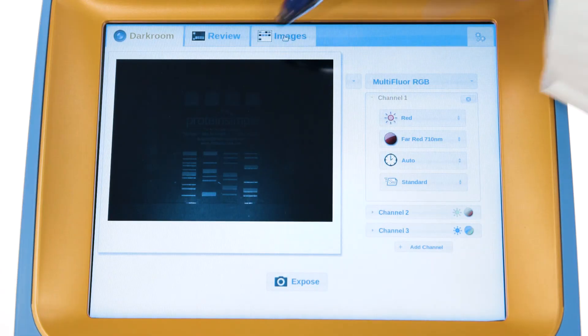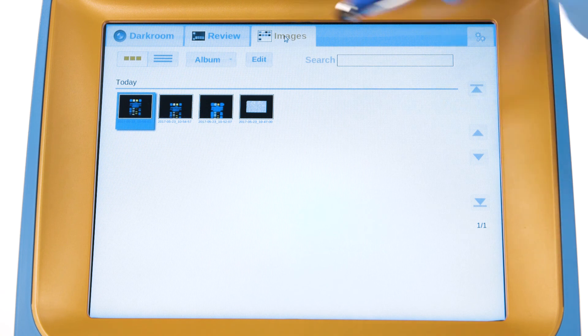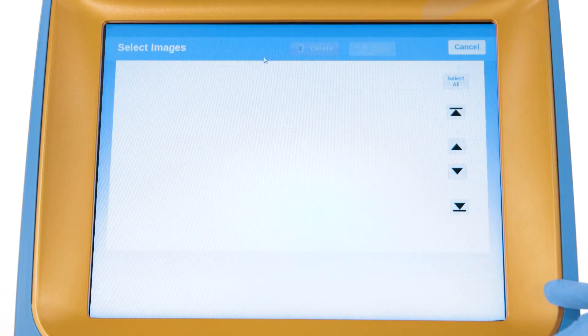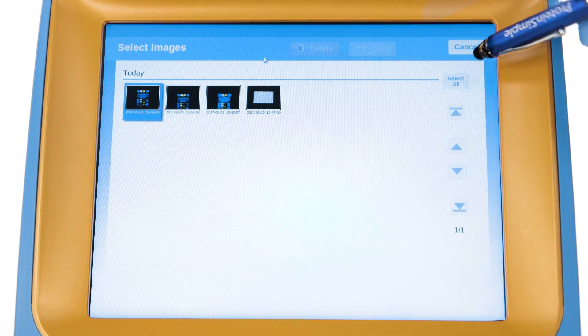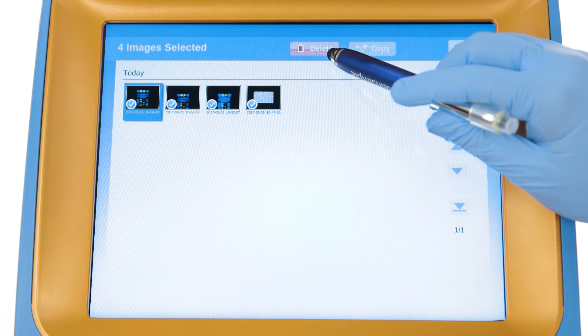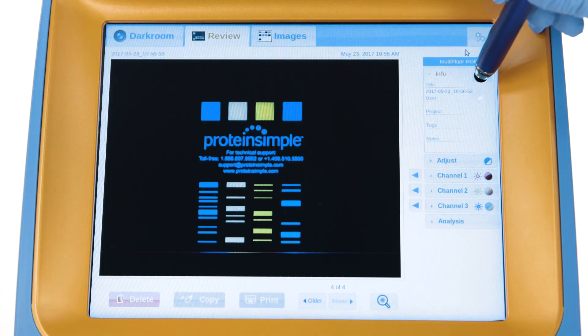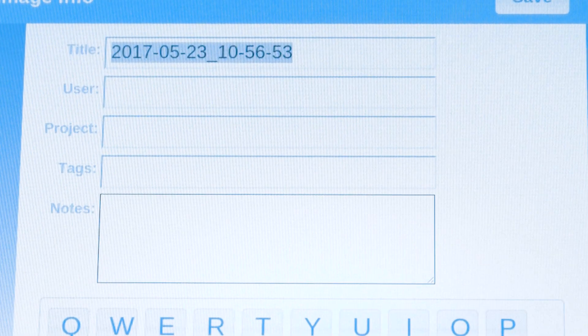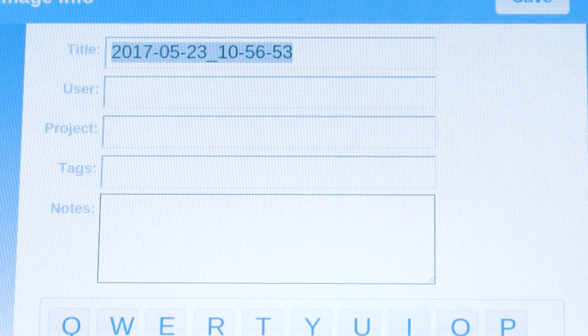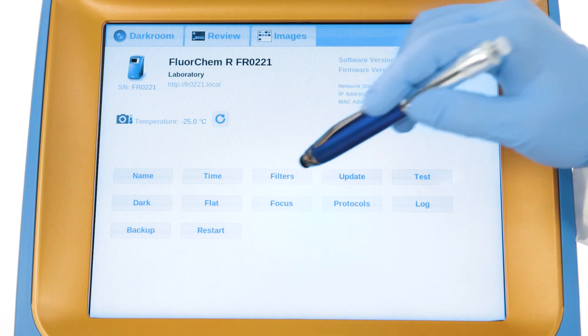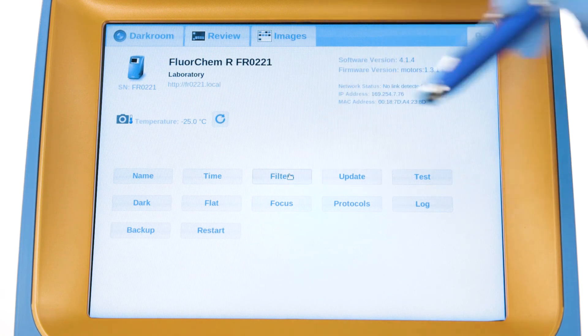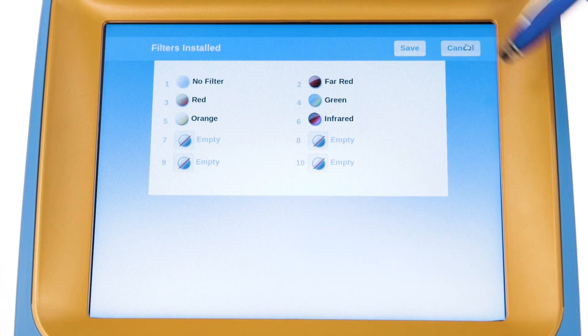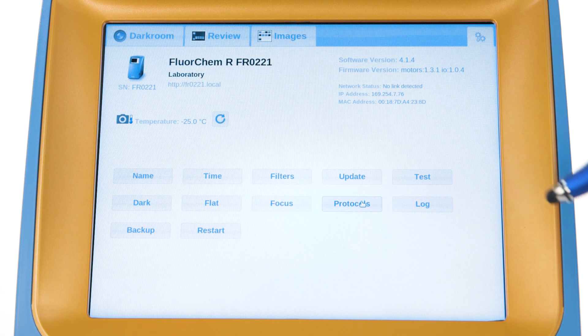The Image tab allows you to review all the images that are stored on the FluorChem hard drive. From here, images can be deleted or archived. Images can also be annotated with user names, tags, and notes that are searchable in the Images tab. The Settings tab allows you to add or edit custom filters. You can also create and save custom protocols.